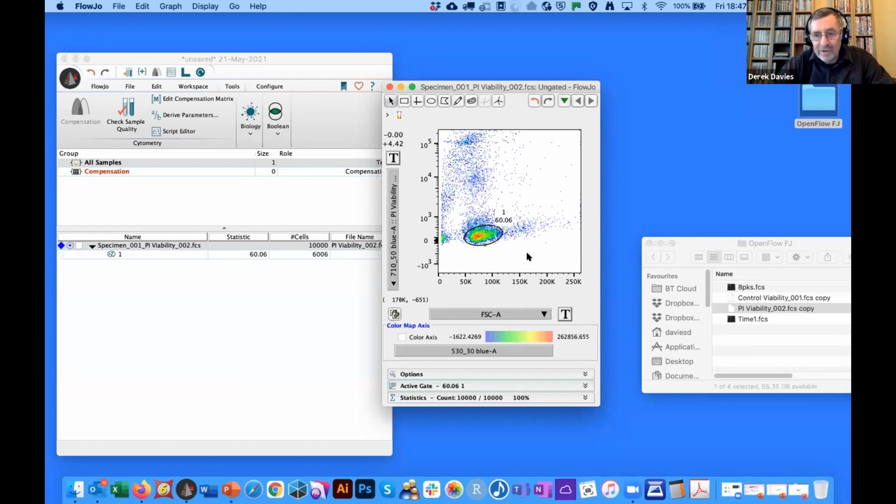It's not necessarily what we're interested in. If I were doing this experiment on a hemocytometer with trypan blue, I'd be looking at cells, whether they were live or dead. These little bits of debris and broken up bits of cells, I would be filtering out visually. So we also want to do that in our data analysis.